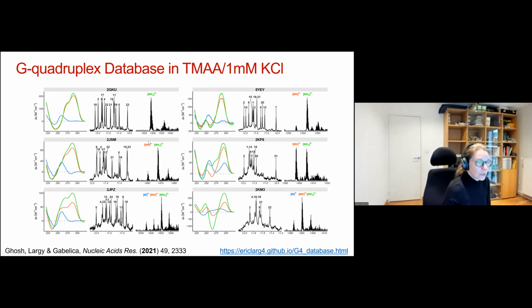And you can see which sequence you might want to include in a screening assay, for example, and have here the validation, to what extent the structure in mass spec conditions matches what you would know from NMR in high KCl conditions. And most of the time, when we don't have a really good match of the CD spectra, it's more a matter of intensity, of amount formed.